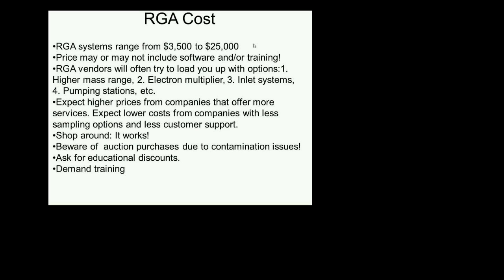So depending on your level of comfort on learning new technology, depending on your level of comfort on installing a new piece of equipment in your system, my take would be, if you are a self-starter and you're comfortable with instrumentation, I will always go for the cheapest one. If you need more help, I would pay a little more. You probably won't get more performance in terms of what the device itself does, but you're going to get a lot of help. And, you know, that might be priceless, right?